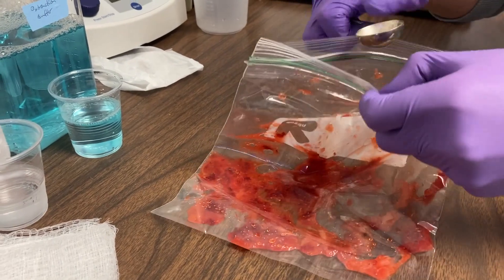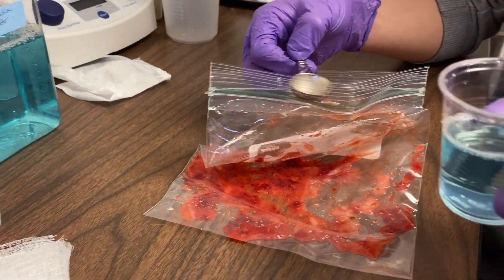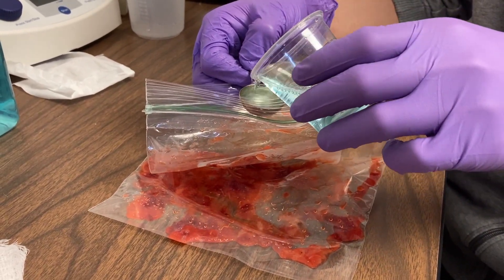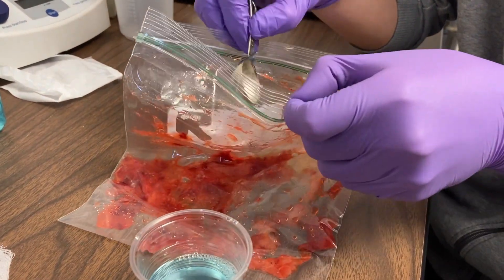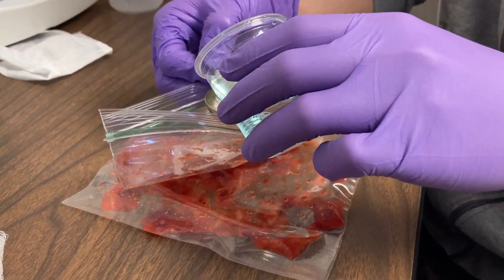Next, we're going to add this blue solution we call Extraction Buffer. It's mostly made out of liquid detergent, or soap, and a little bit of salt. If the strawberry is made of cells, you may know that it has a cell membrane. And because it's a plant, it also has a cell wall.